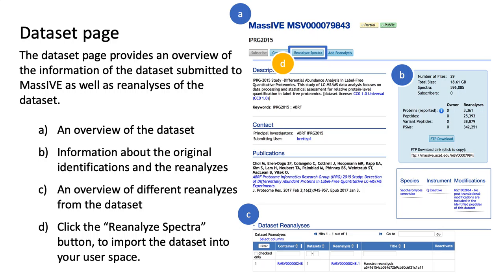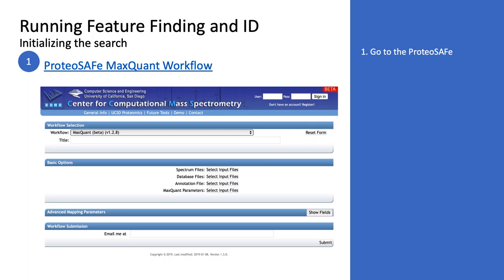But what we want to do right now is not database search, but we're going to run the MaxQuant workflow, because we're going to see how we can get some quantification results for this data set. So go back to the slide and click on this link for the ProteoSAFe MaxQuant workflow.